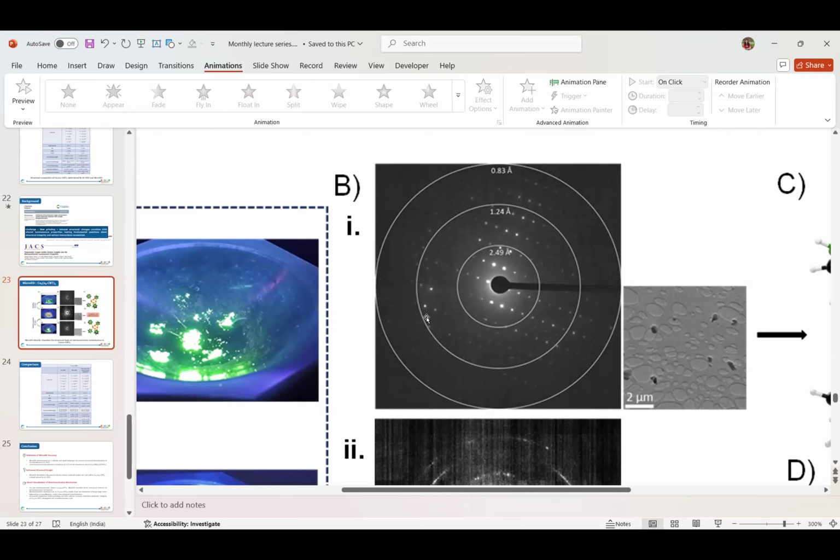So this is primarily because of the multiple diffraction from the same electrons, not... Yeah, multiple scattering, yes, multiple scattering from the same electrons. So that's why we don't get mirror image kind of Friedel pairs. So Friedel's law is not really valid for electron diffraction, at least for thicker samples. For very thin samples, it kind of holds, but for thicker samples, because of the multiple scattering, it doesn't really hold.